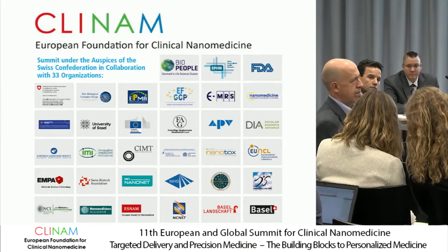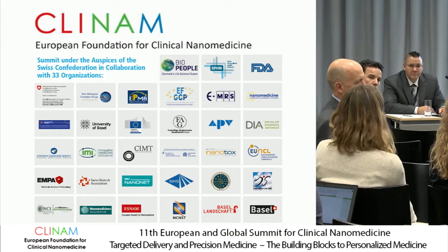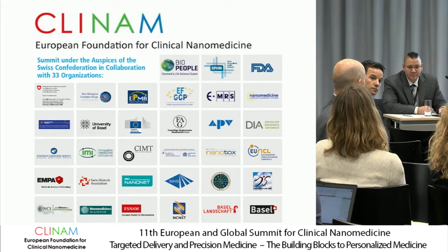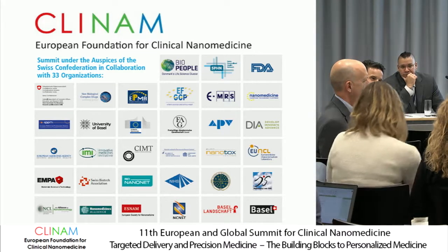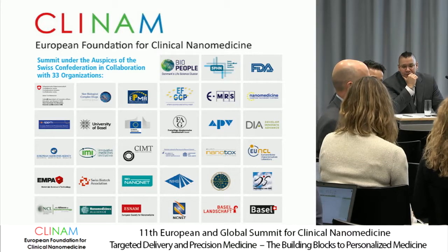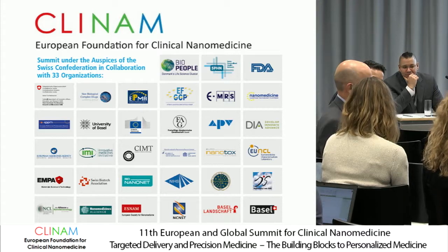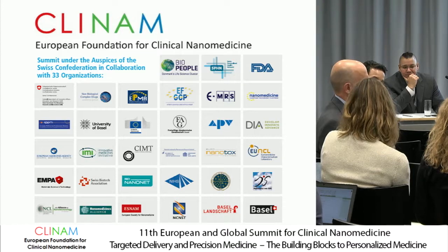Measuring liposomes, and measuring liposome number and the accurate distribution of liposomes, has been available for at least 10 years. It wasn't a new technique invented last week. I mean, it's really quite simple. And I get a little frustrated with the leadership where they perpetuate the use of DLS at 78%. It's like people are too frightened to say, people, just stop using it. It's just useless. And you, the leaders in the field, ought to be standing up and saying it, but it's like you're too frightened to upset everybody, to upset the manufacturers or whatever it is.